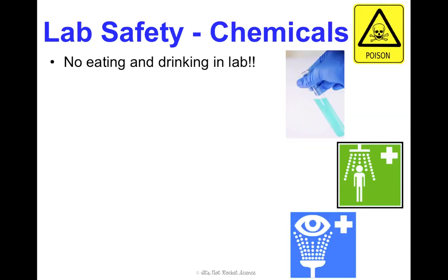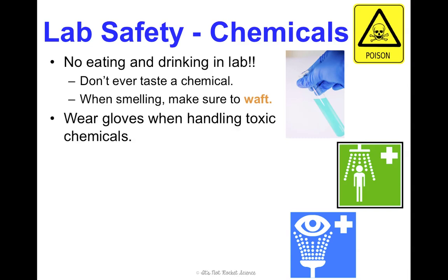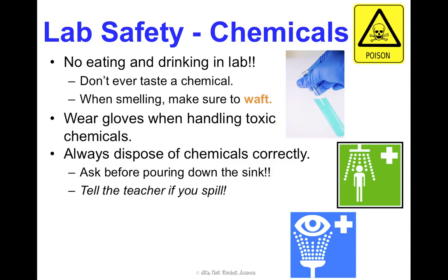Speaking of chemicals — no eating or drinking in lab. You never know what could contaminate what you're eating or drinking, and we don't want any chemicals getting in your mouth whatsoever. You should never taste a chemical. Even when smelling, you shouldn't just take a whiff — you should waft the chemical, which I'll show you how to do in class. Wear gloves when handling toxic chemicals. Also, always dispose of chemicals correctly; not everything can go down the drain. Some have special disposal methods, so make sure you ask. If there's a spill, let us know because some chemicals have a more extensive cleanup process.